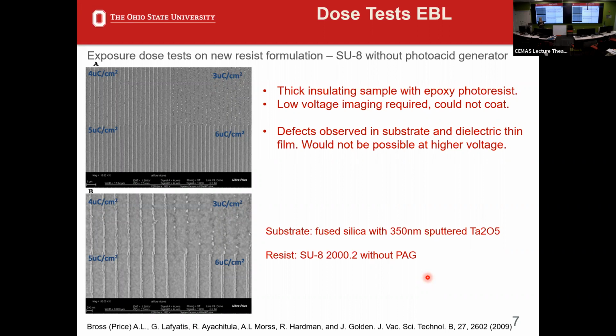So it doesn't affect the electric field at all as you're coming down the column? You put only a couple of volts on it. Oh, cool. A few volts, not hundreds of volts. 2 or 3 volts negative, and that's enough to attract electrons towards the sample. Very interesting. Tell me more. I can actually do that in my chamber. Yeah, just tungsten wire. Cool. We have plenty of those. We have an old tungsten emitter. I can steal an emitter from my little tungsten emitter.